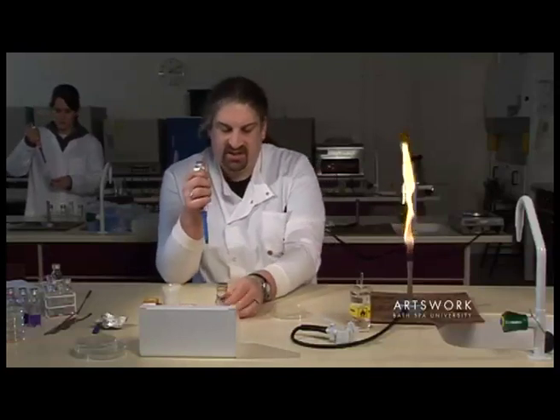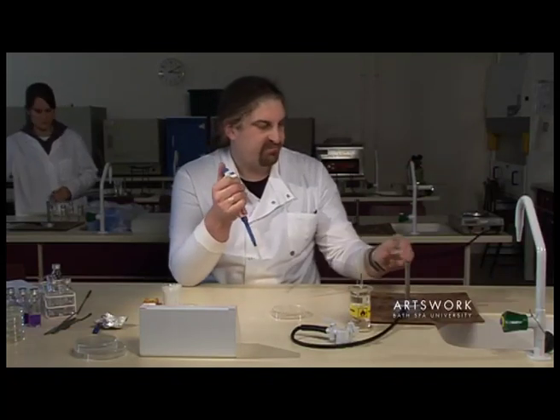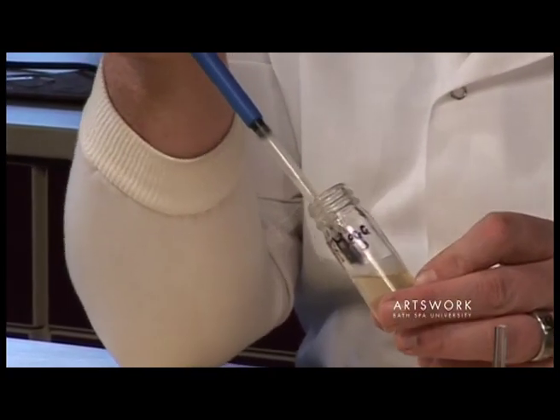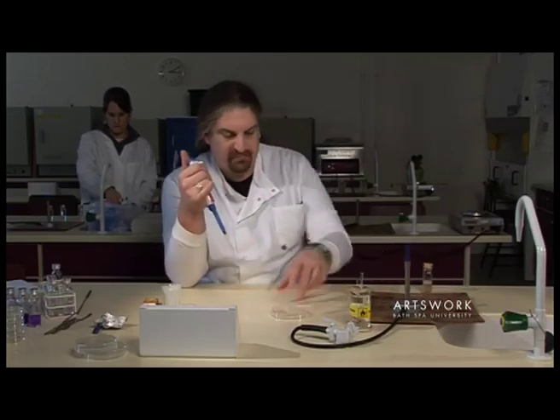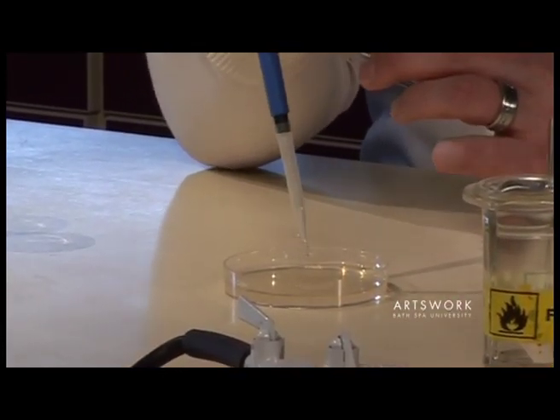Fit our pipette tip. Then open our culture, sterilise it, draw up half a mil, and then simply pipette that onto the surface of the agar plate.